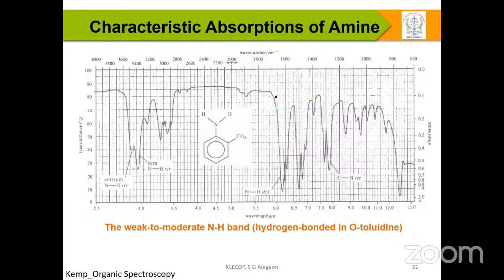Apart from the CH stretch of CH3, CH2, and aromatic, one should understand there are two weak peaks: one is the symmetric and another is the asymmetric NH stretch.